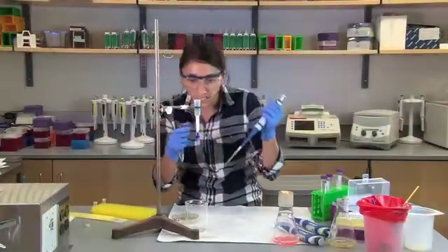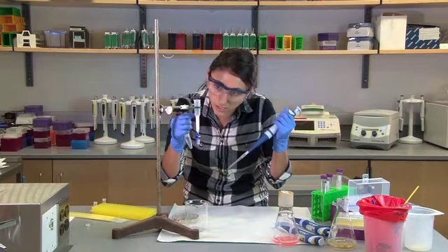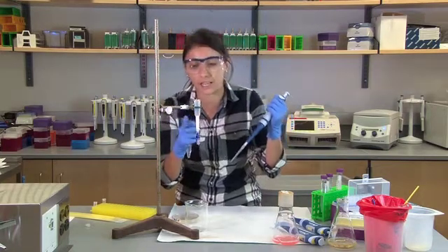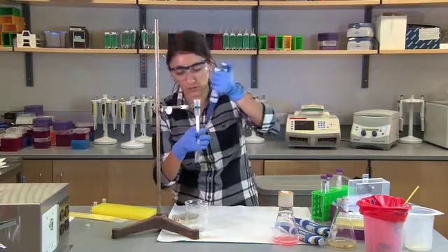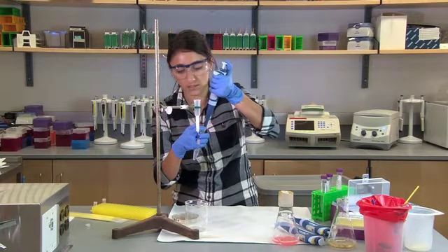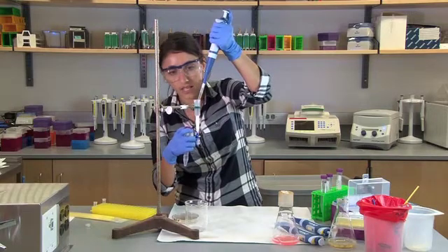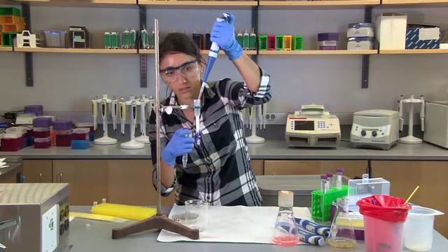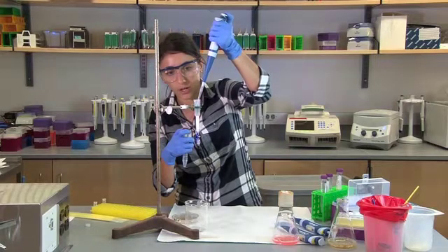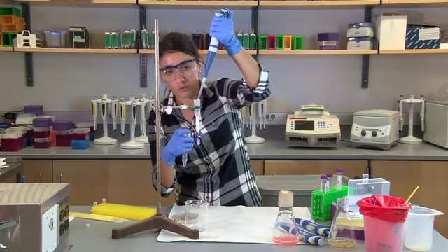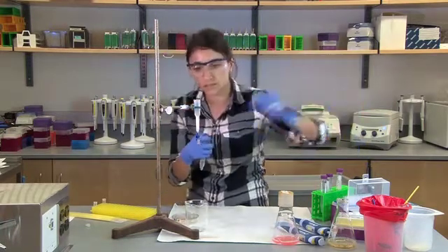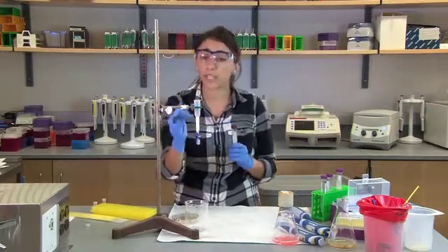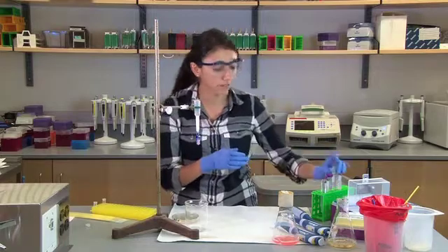So we can see that the pink is starting to move onto the column, but it's still hanging out at the top. So now I'm going to add the next buffer, which is the elution buffer, again slowly down the side so as not to disturb the resin bed. And we'll start to see the pink band move down the column.